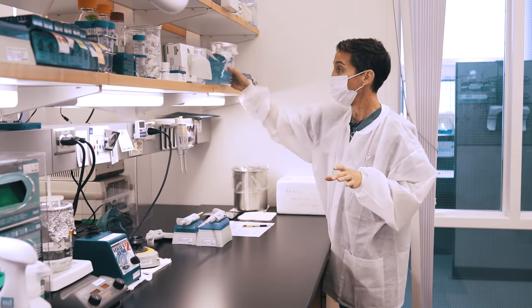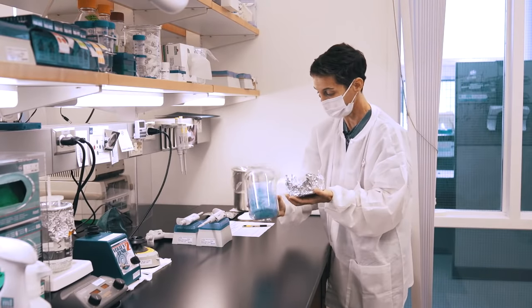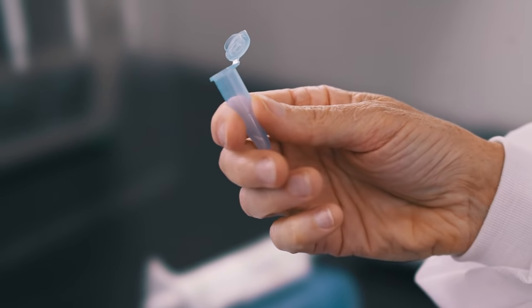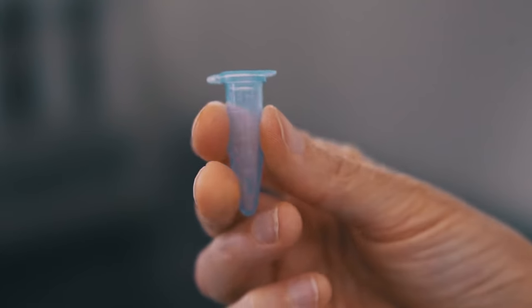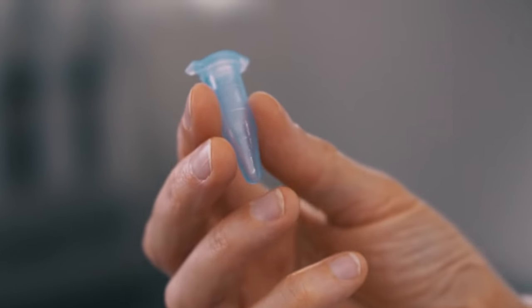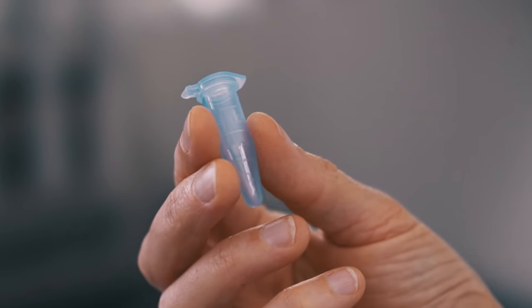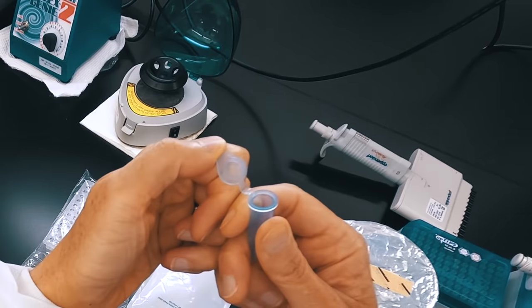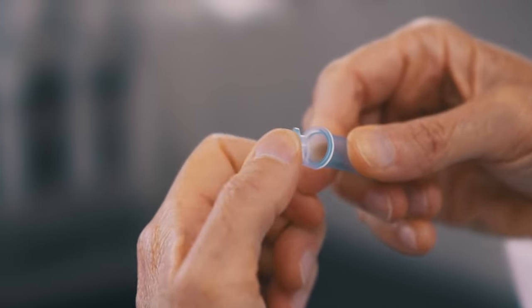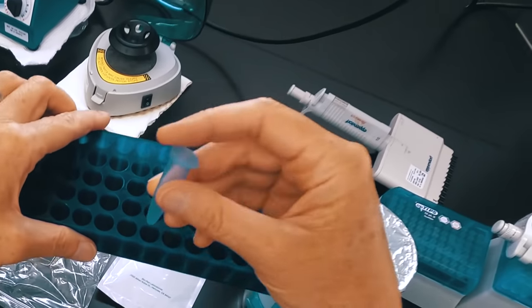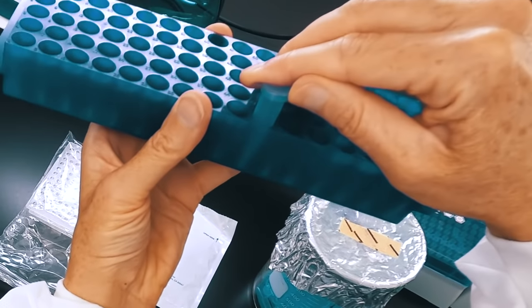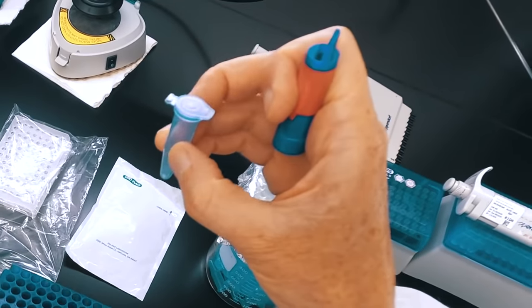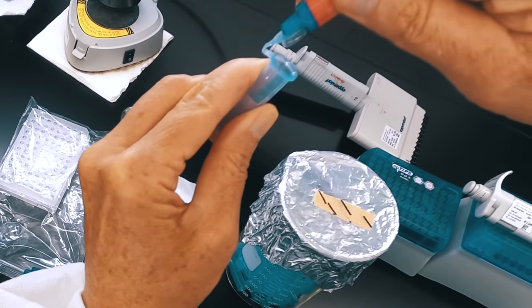Other pieces of equipment that we will use are 1.5 mil tubes. These are the 1.5 mil tubes that we do most of our work in. They have a hinged lid that snaps shut and is then watertight. There are correct and incorrect ways to open these tubes. One of the correct ways is with both hands and being careful to not touch the inside of the tube. Another correct way is if the tube is in a rack you can open it without touching the inside of the tube. A third method is with a tube opener which very handily helps you not touch the inside of the tube.